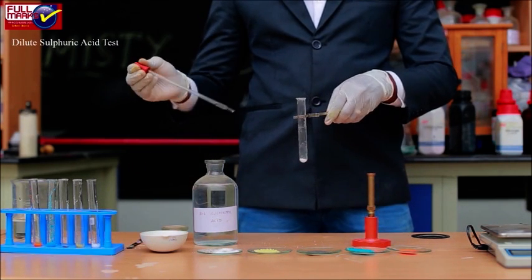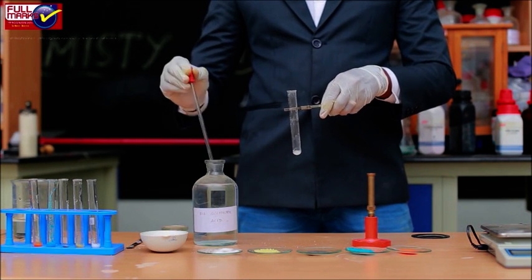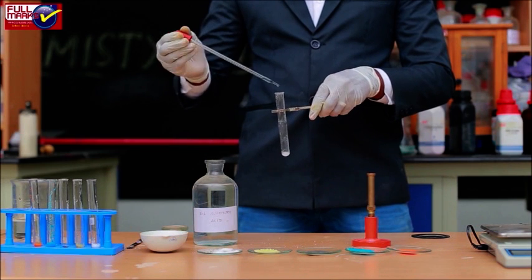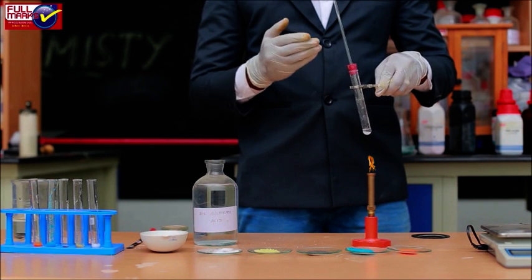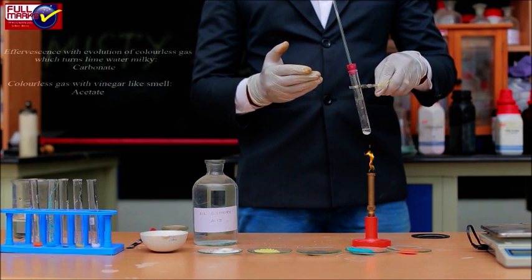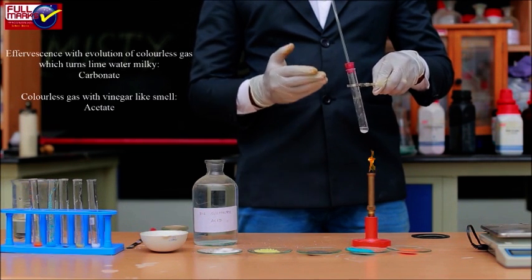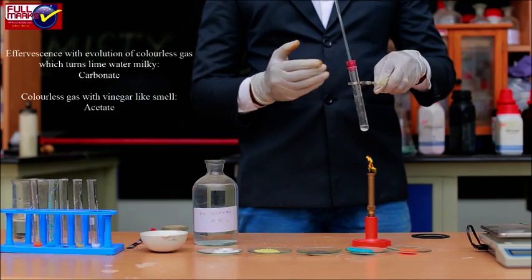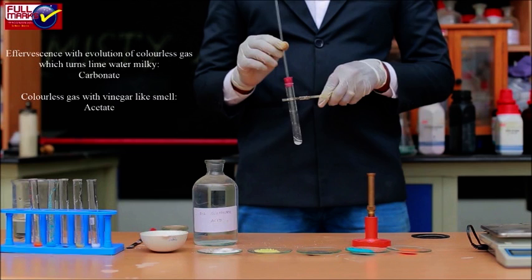Dilute sulfuric acid test: A pinch of salt is taken in a test tube. Dilute sulfuric acid is added so that the salt gets submerged. If no reaction is observed at room temperature, then the solution is heated. If effervescence with evolution of colorless gas occurs which turns lime water milky, it's a carbonate. If colorless gas with vinegar-like smell is observed, it's acetate. Finally, one cation and one anion in a given salt is determined.